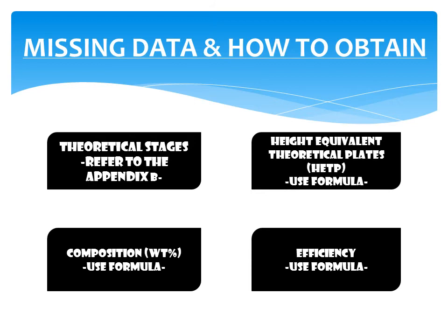On the theoretical stages, we can refer to Appendix B. On the height equivalent to a theoretical plate, which is HETP, we can use the formula that is provided. On the composition, we also can use the formula. And the last one is for the efficiency. We can use the formula provided in the lab manual.